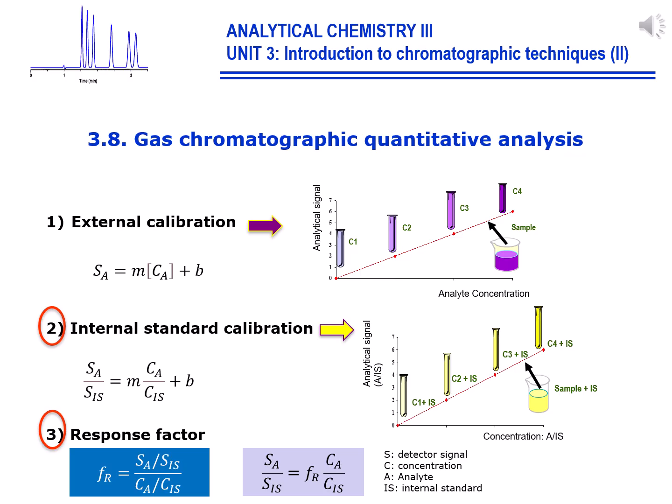As we explained in Unit 3, the internal standard is always added at a fixed concentration, and it's a compound that has similar characteristics to the analyte for the detector. It's mandatory that the internal standard retention time be different than the retention time of the analytes to be measured. In other words, the internal standard must give a totally resolved peak in the chromatogram.